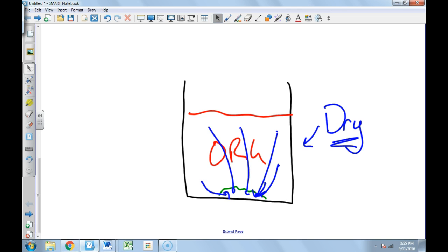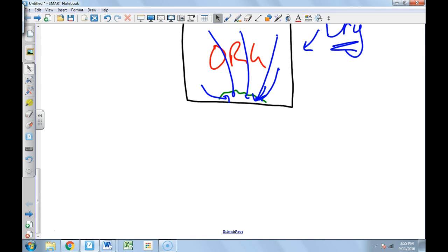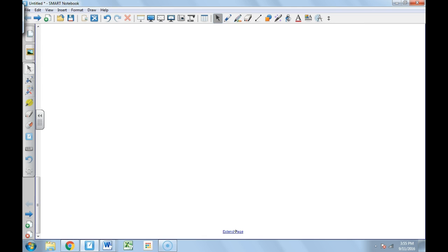But now, as we keep going, we have an organic layer with a big clump of solid in here. In order to get rid of that solid, we have to filter it off. So we're going to set up a standard filter procedure. We always filter into a flask.